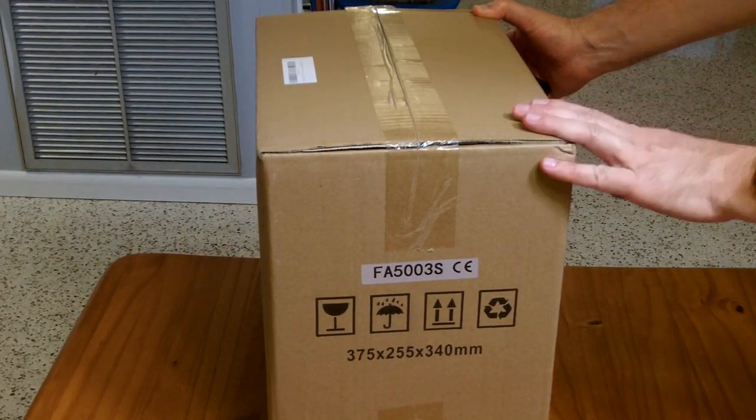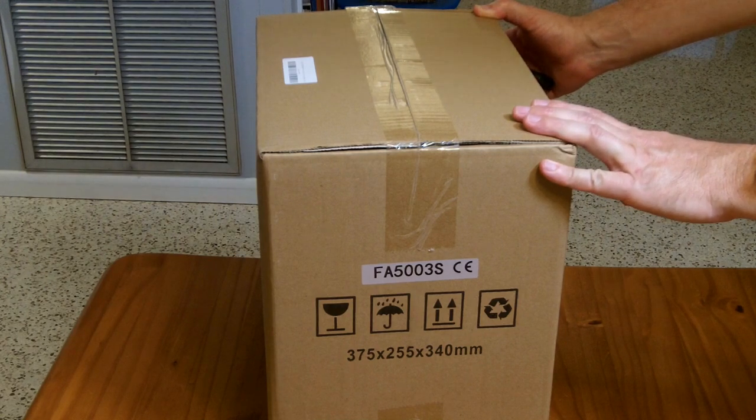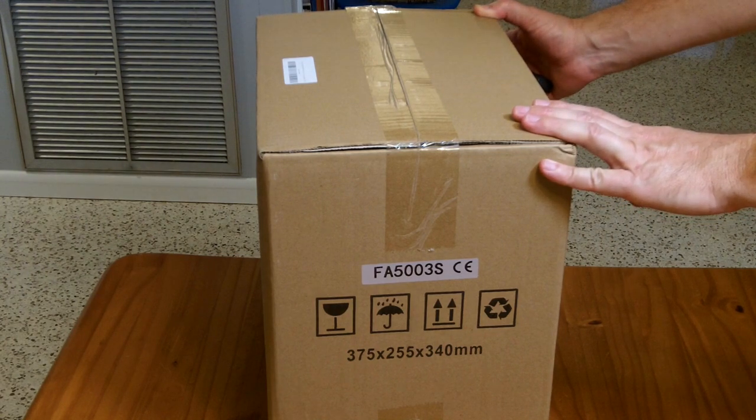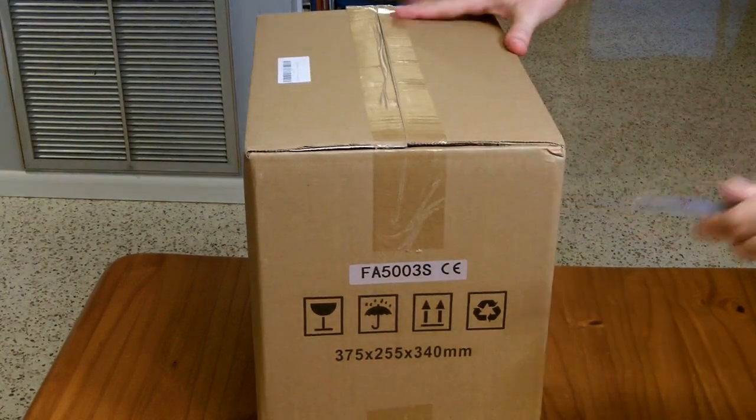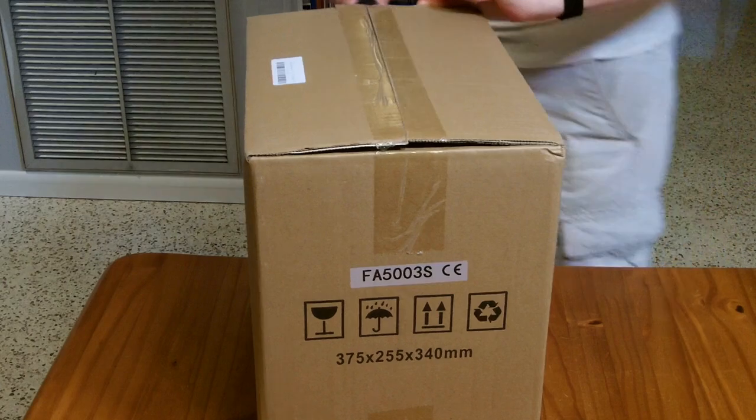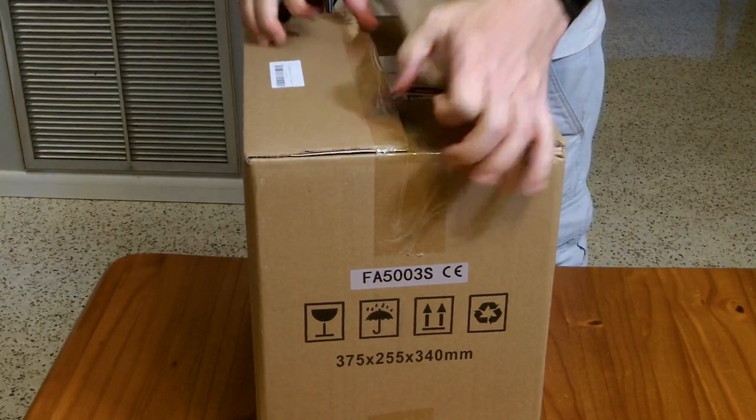So this is a 500 gram scale, except when they're this precise and expensive you can't call them a scale, you have to call them an analytical balance. This is a JoanLab 500 gram analytical balance and it is accurate to a thousandth of a gram or a milligram.